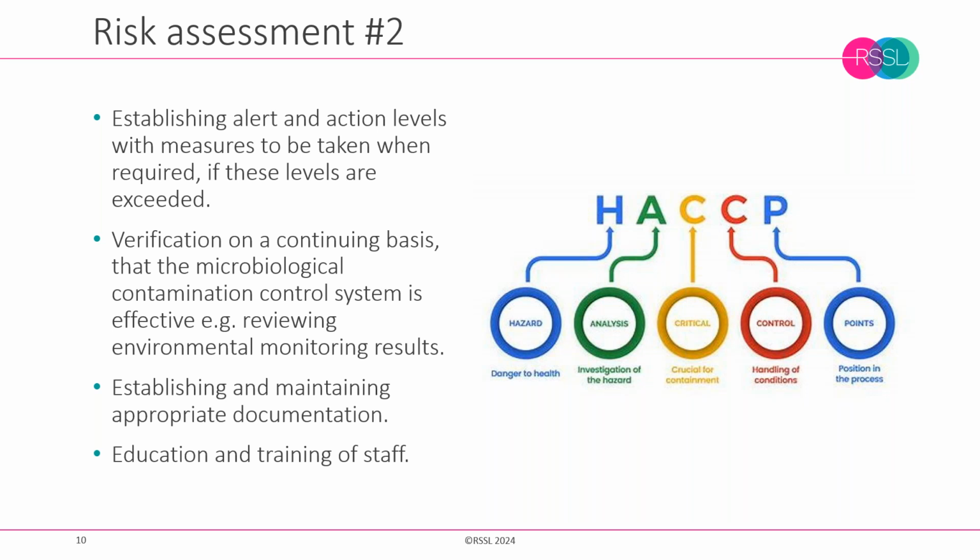And of course, as with anything in pharmaceuticals, we need to make sure we're appropriately documenting things, and that the people carrying out these important tasks are aware of what they're doing and why they are doing it.